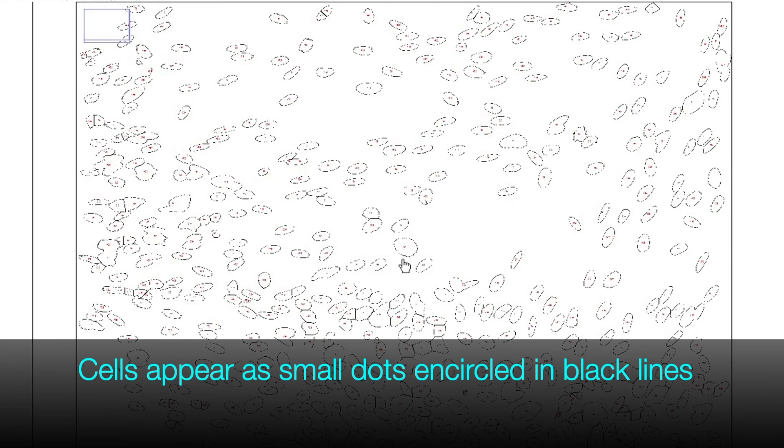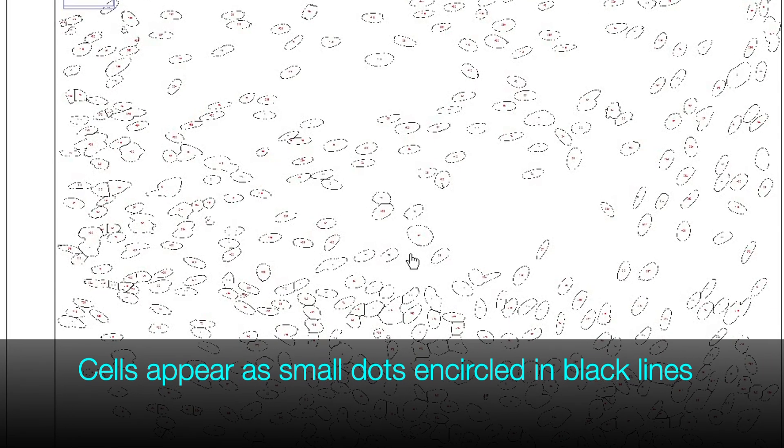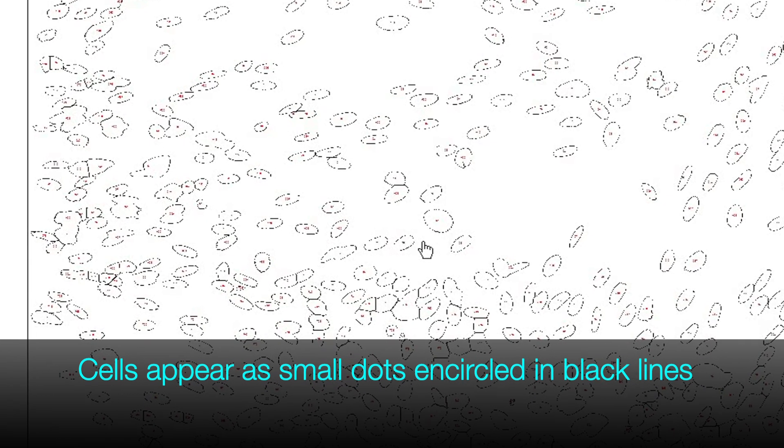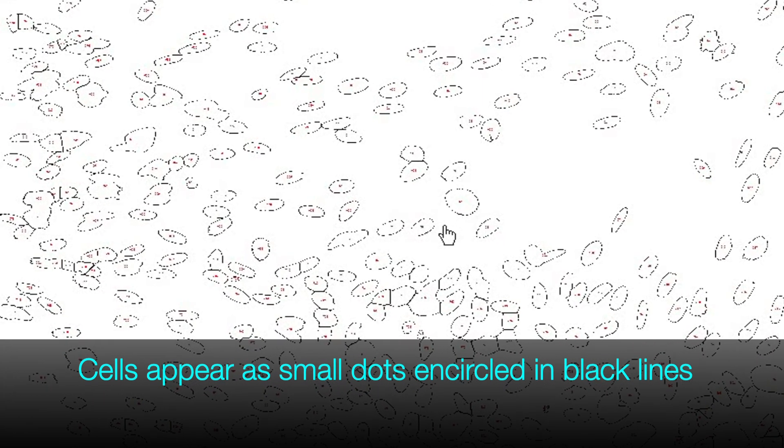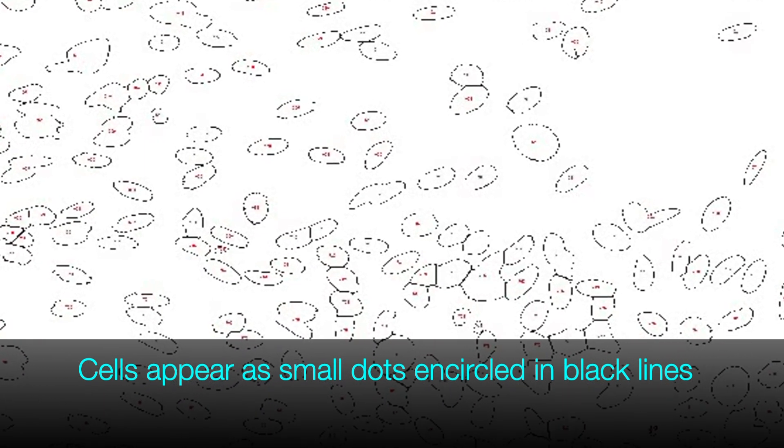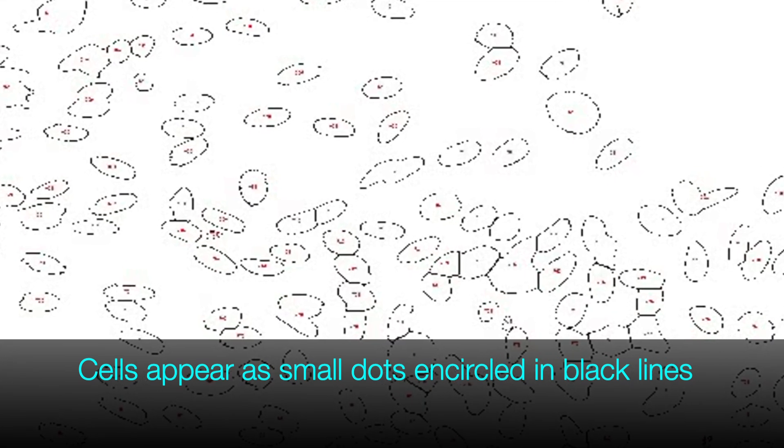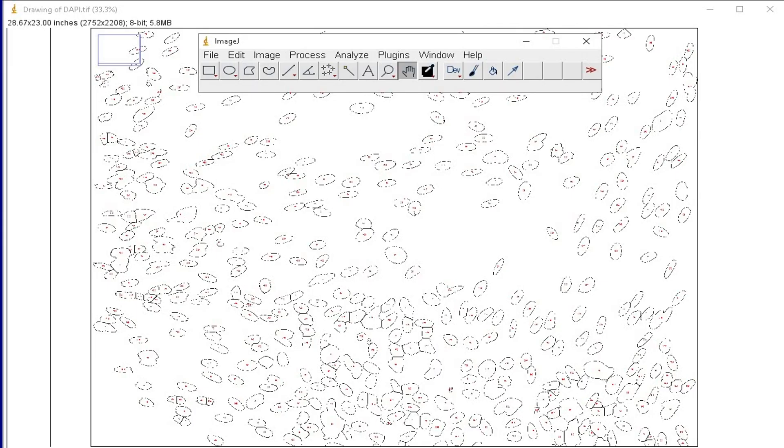Now, all the DAPI stain cells have been converted into small red dots, encircled with black lines.